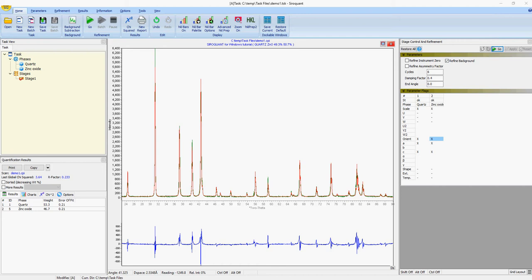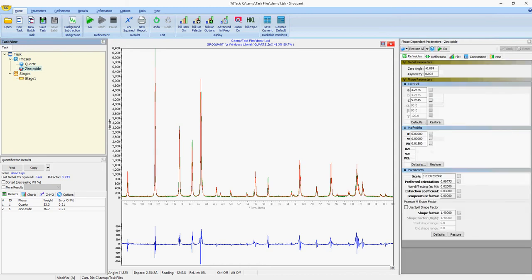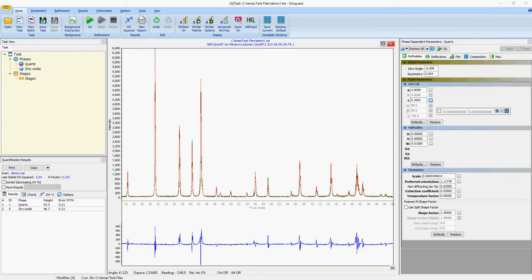So now going back to the phase dependent parameters window, we can now see the values for the parameters that we refined, which are the unit cell in this case. A useful tool here is that if you want, you can enable refinement limits for any refinable parameter, and this just allows you to have SARAquant stop the refinement if it hits a particular limit. This can be particularly useful for w's where it's very easy to over refine the w.